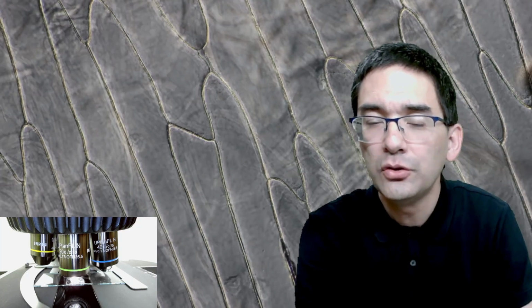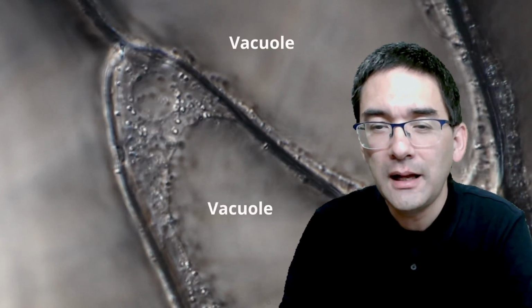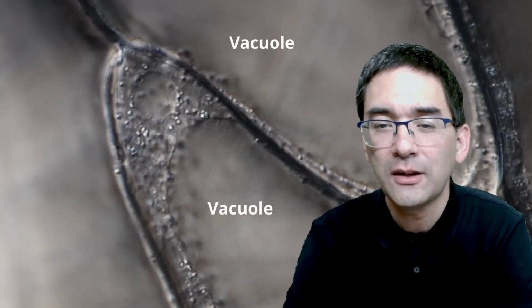But I'm going to show you nevertheless another video, because you also want to see the vacuole. Some time ago I found some onion cells and did a time lapse. I just want to show it to you. It's quite nice actually, and I also added some labels. So here, this is a video, as I really zoomed in. I labeled the cytoplasm, and over here, that's the vacuole.